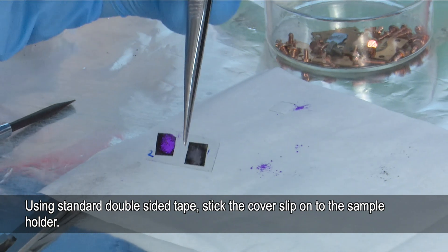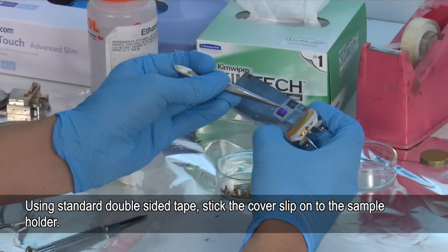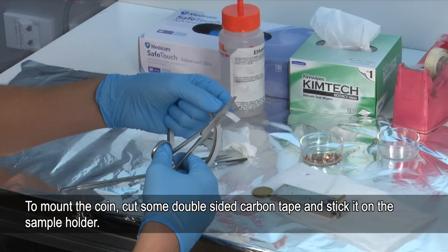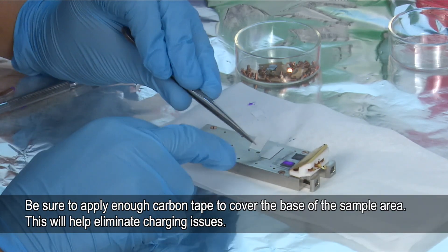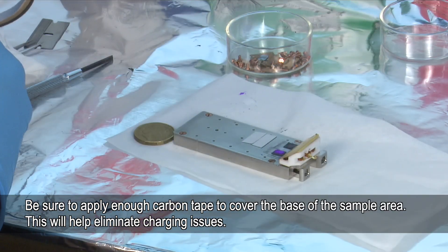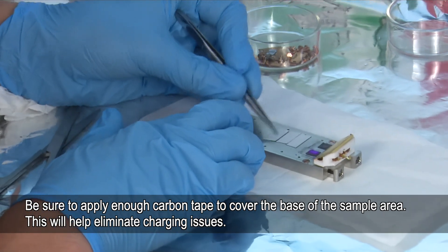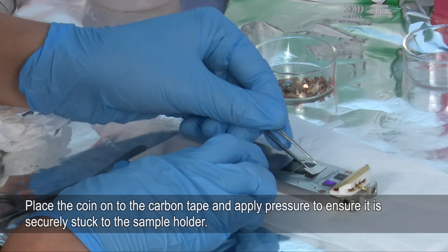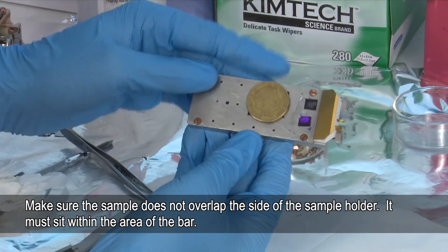We can now stick these to the sample holder using standard double-sided tape. I'll place this on the holder and stick the samples on the tape. I'm going to use the black carbon tape for this. We're putting enough tape down to cover the whole bottom of the coin — that's just to help with any charging issues we might have. It's important to make sure that none of the sample overlaps with the side of the bar. Here the coin is flush against the edge of the bar, which is good.